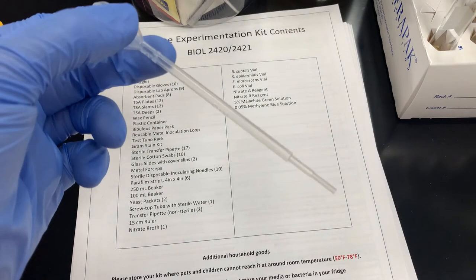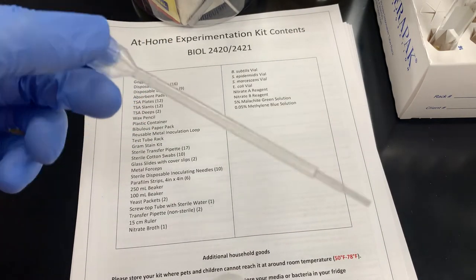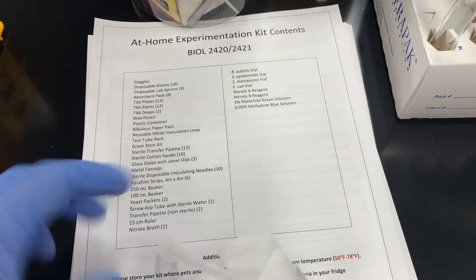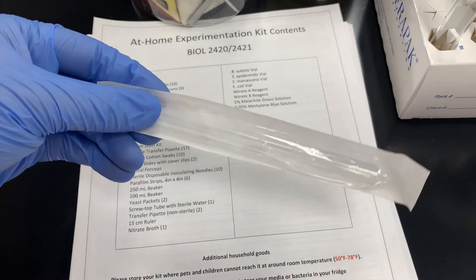So these are the non-sterile guys, okay? They do not come in packaging. You're gonna use these at very specific points. One of them is gonna be for the gram stain. You're gonna label it for water and you're just gonna use it to squirt water on your slides. That's reusable. And then the other one is for a later lab. It will be very specific about using a non-sterile one so that you don't waste the sterile ones.